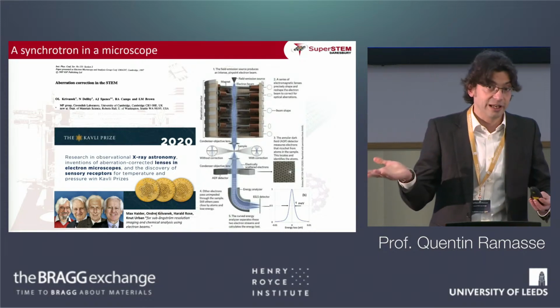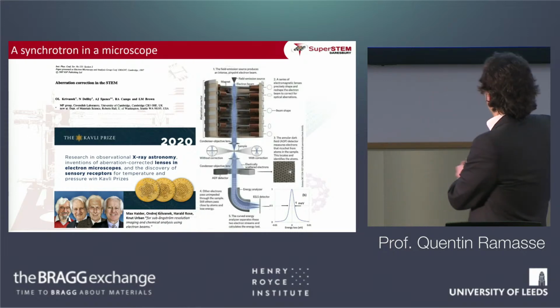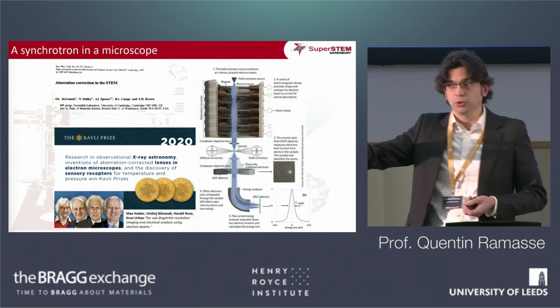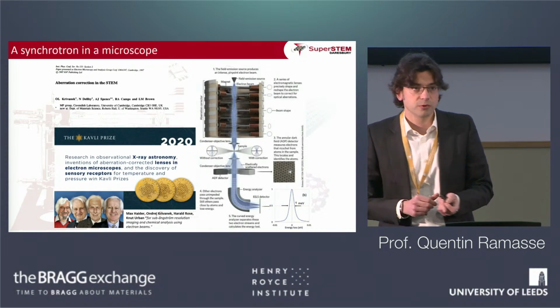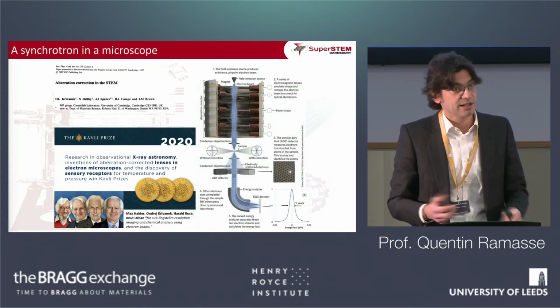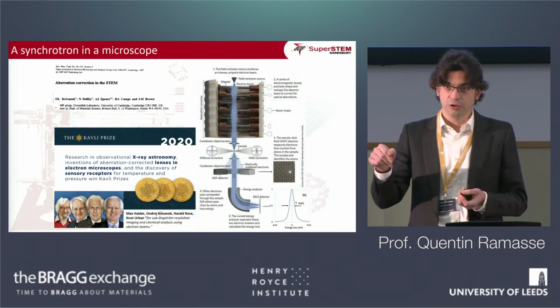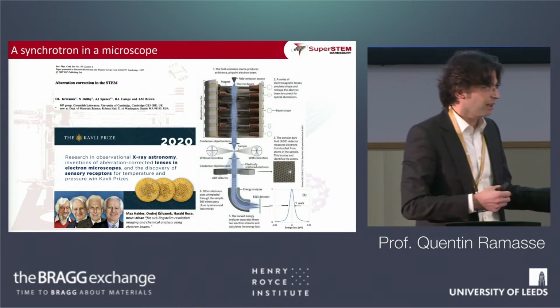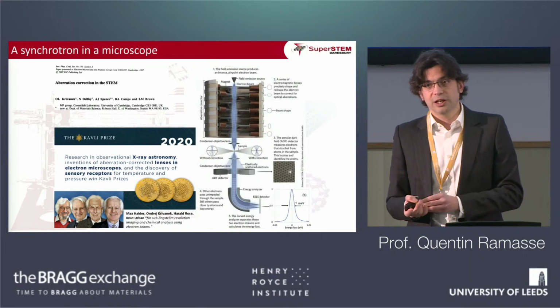And also you can collect images using imaging detectors, in particular one that would be donut-sized with a hole in the middle, collecting electrons that have scattered from your sample to high angle, and you do that typically through something that would be akin to Rutherford scattering, therefore a process that is sensitive to how heavy the material is that you've actually gone through. So your images are weight sensitive in that they'll look slightly brighter if what you look at is slightly heavier, or not quite as bright if what you look at is less heavy.